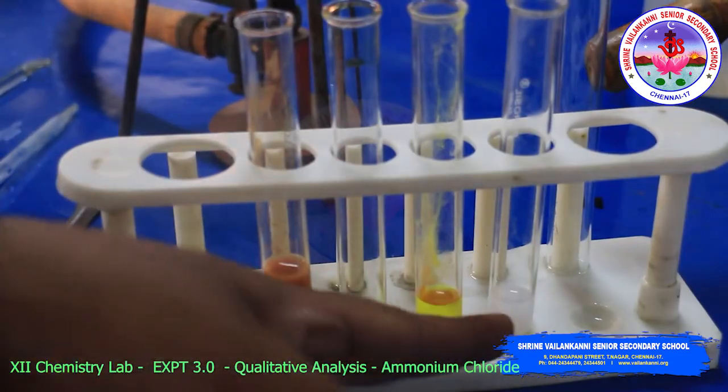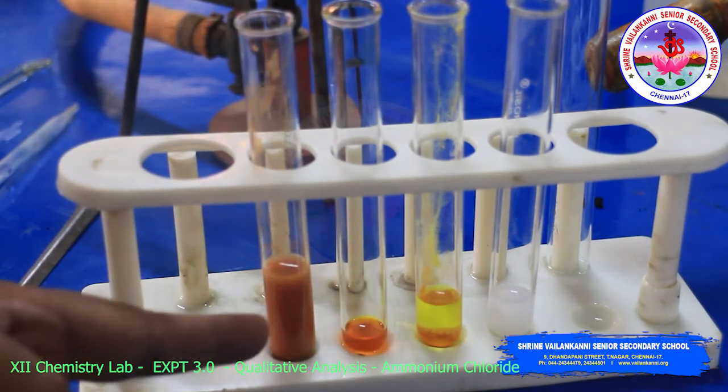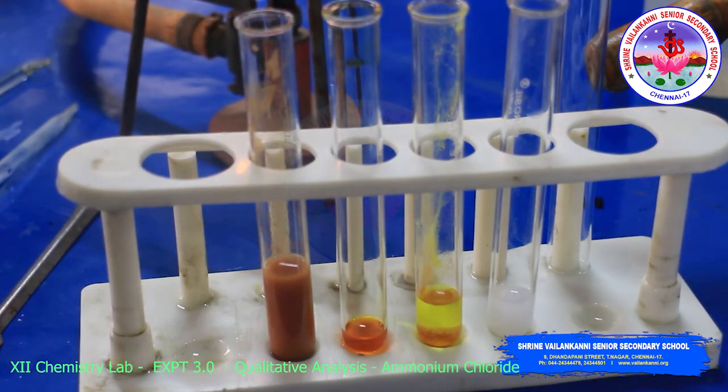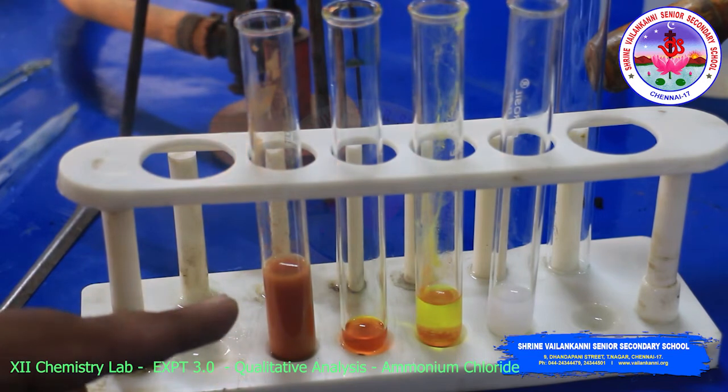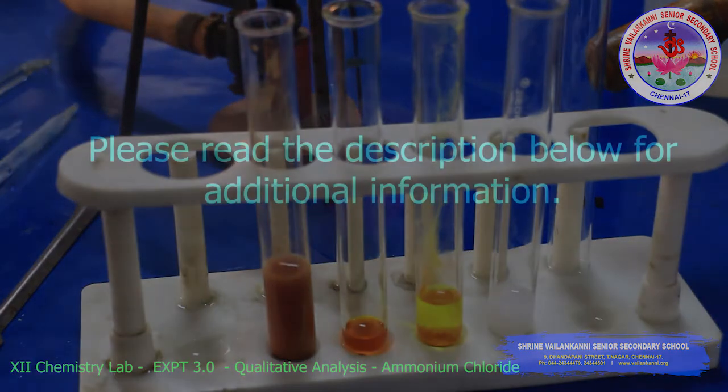See, this is the confirmation test for chloride, and this brown precipitate indicates ammonium. So the substance is called ammonium chloride. The basic radical is ammonium and the acidic radical is chloride. So the given salt is what? Ammonium chloride. Now we will do the next salt analysis.